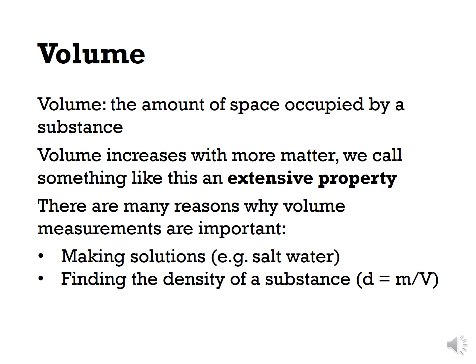For example, if you're following a recipe to make solutions, you might need to know the volume of the solution you need to make. For example, if you're preparing a solution of salt dissolved in water. Or if you'd like to find the density of a substance, you need to record the volume of that substance.